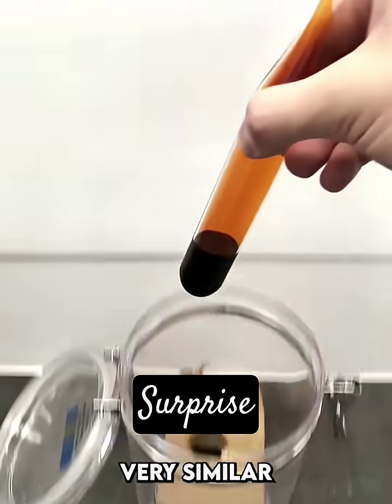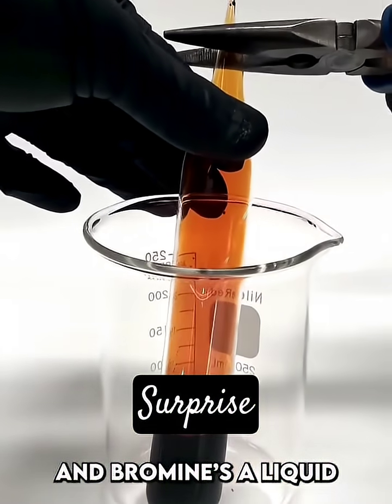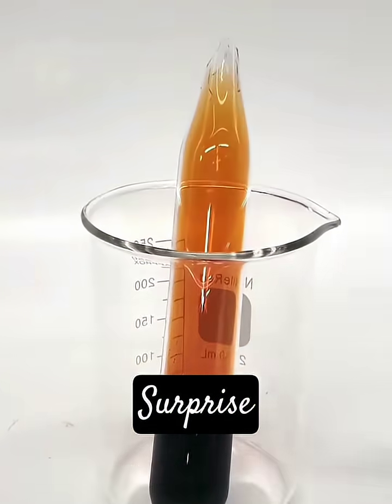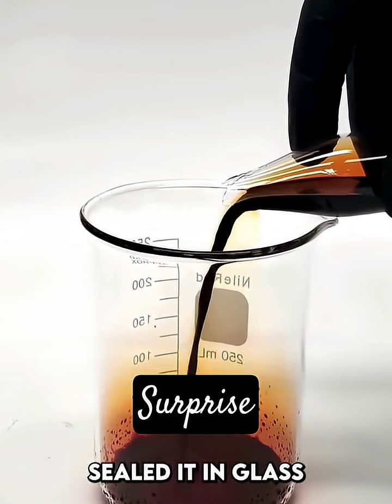This is bromine. It's chemically very similar to chlorine, except chlorine's a gas and bromine's a liquid. It also lets off a lot of nasty orange vapor, and this is why I sealed it in glass.